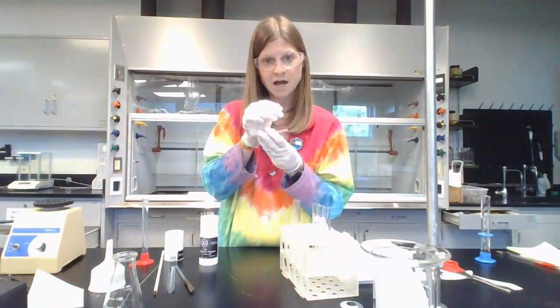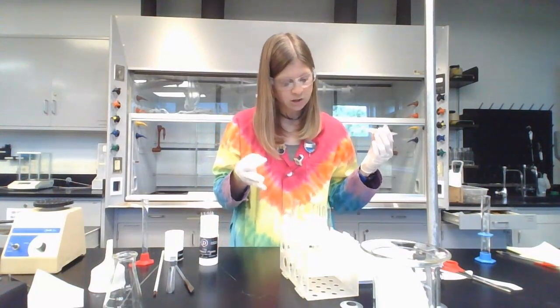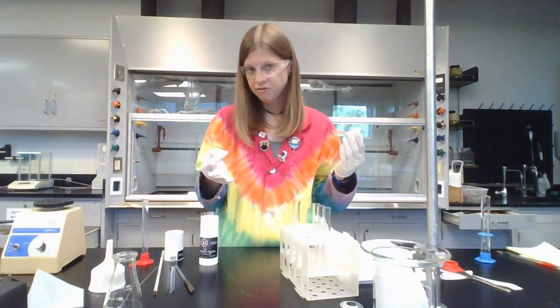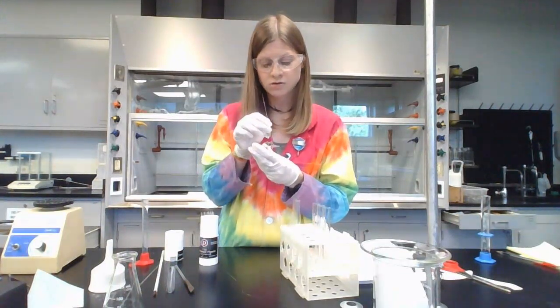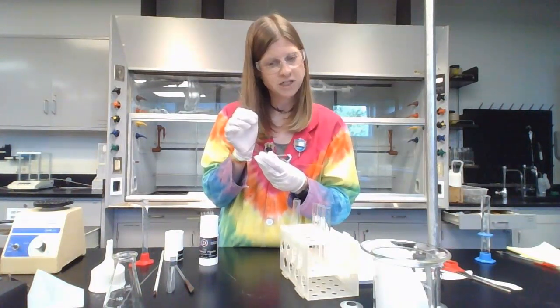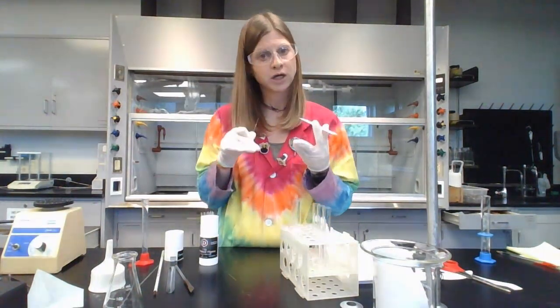The longer you hold this down, the wider it gets. Now, we're going to do that, but we also want our spots to be dark enough for this to work, like for there to be enough chemical. So once it's dried, you're just going to take it and do that again, a second time, maybe a third time. You don't want the dot to get any wider. We just want to add more layers of chemical so it's more concentrated.